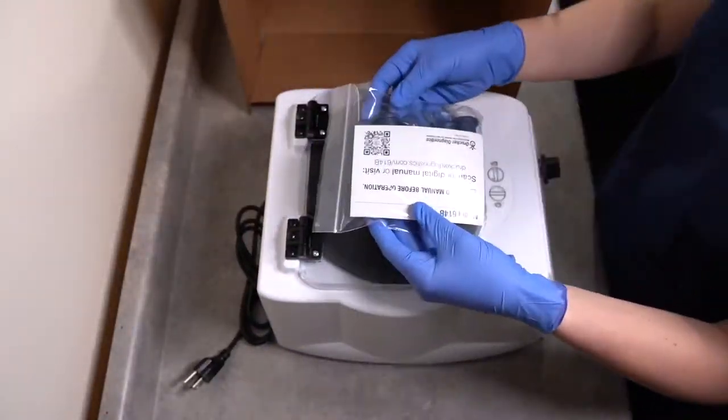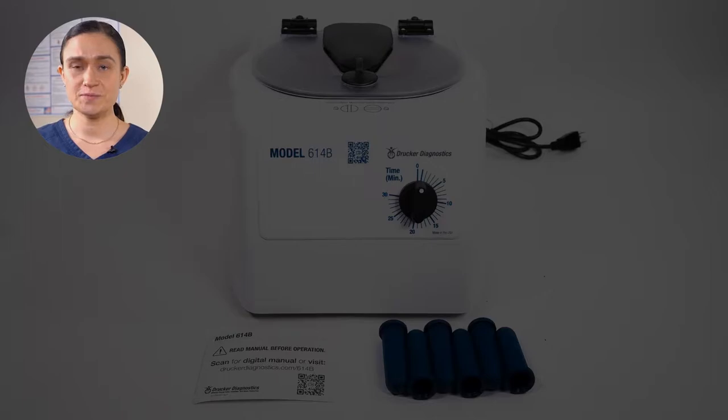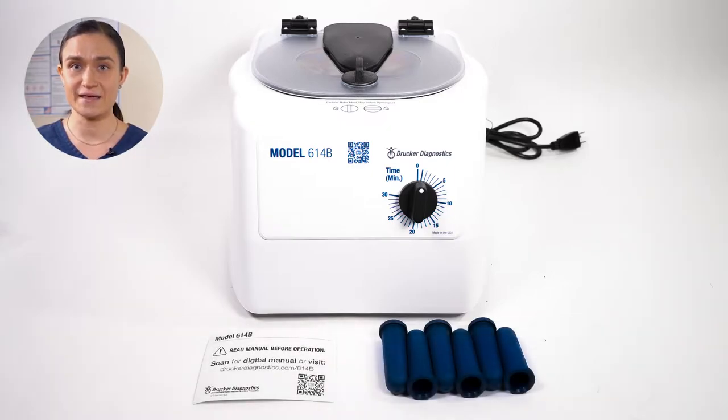Once you're done unpacking, you should have all of these items. Part 2 – Setting up the 614B. Let's start by making sure we have all our necessary accessories. These come out of your accessory bag, the small bag packed on top of your centrifuge. You'll need your tube holders, your quick start insert, and your centrifuge with its attached power cord and pre-installed rotor. If you're missing anything, please contact Drucker Diagnostics.